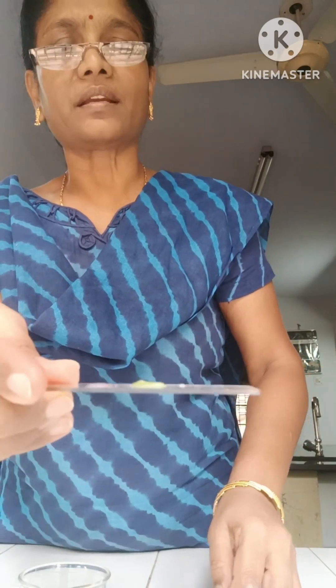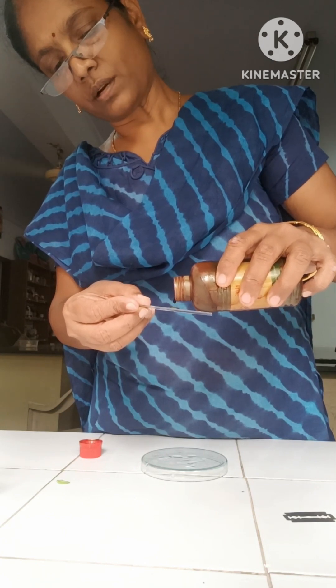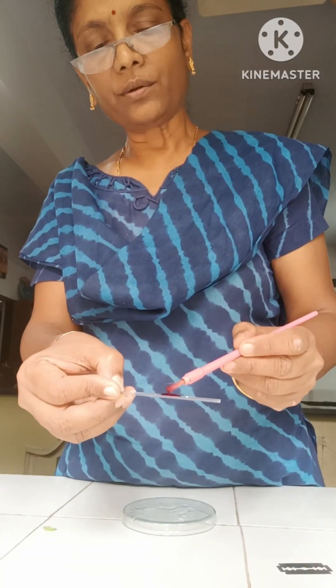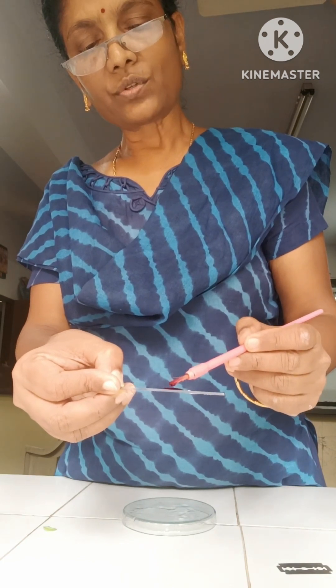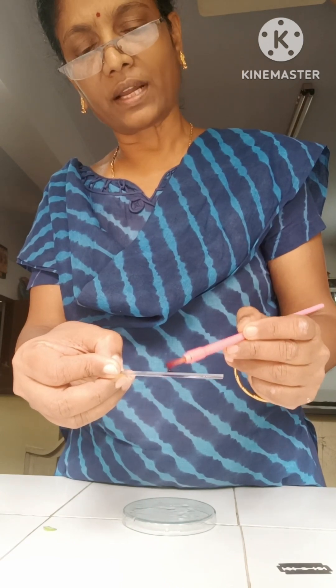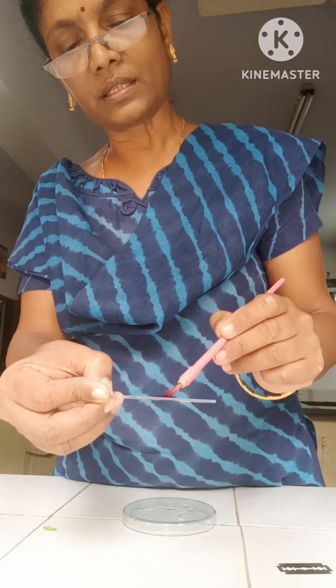So now it has to be stained. For staining we are using safranin. Safranin is to be added on the slide — add one drop of safranin. The cutting now has to be immersed inside the stain fully. If it is not inside the stain, then patches of staining will occur.